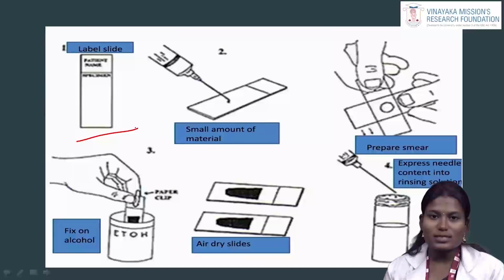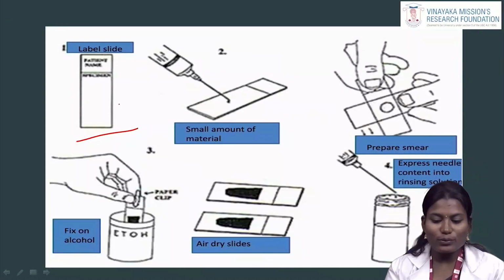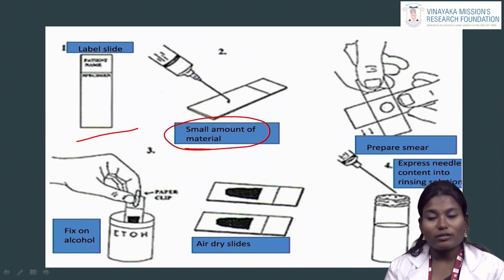The procedure for smear preparation. Here we have to take a labeled slide, labeling the patient's name or patient's UHID number, and then add a small amount of the sample. If we are using the direct method, directly add the sample using the needle.